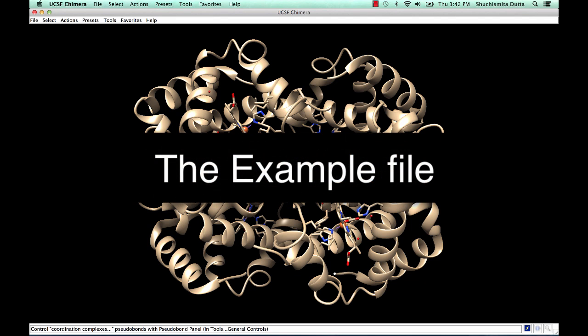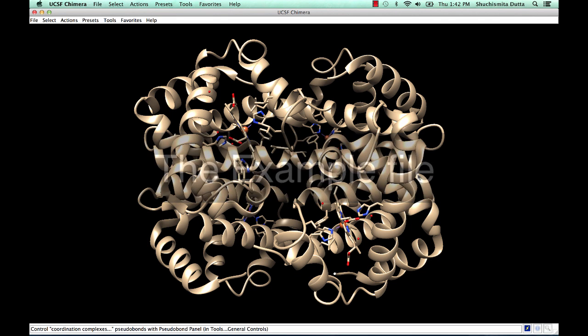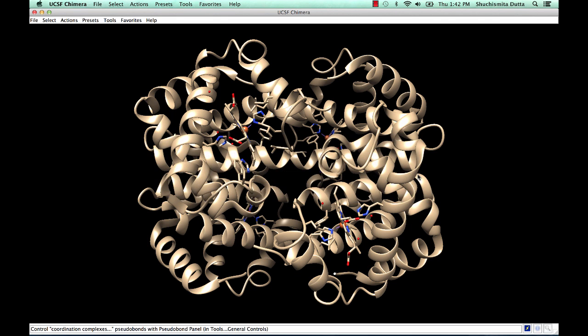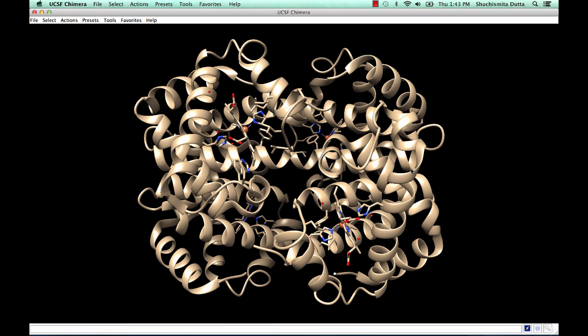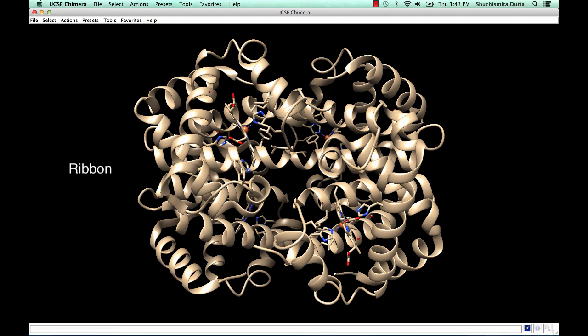The example file used in this tutorial is a hemoglobin structure from the Protein Data Bank with the PDB identifier 2HHB. Notice in the default view, the polymer chains are shown in a ribbon representation, while the heme groups and other ligands and ions are shown in the stick representation.